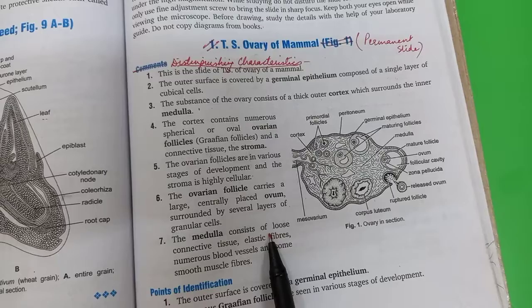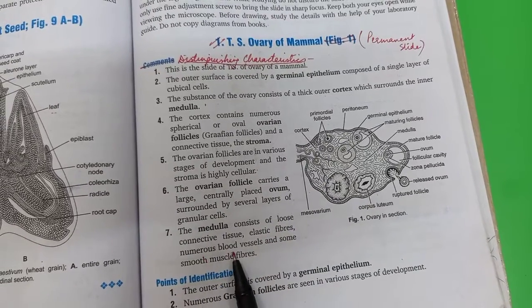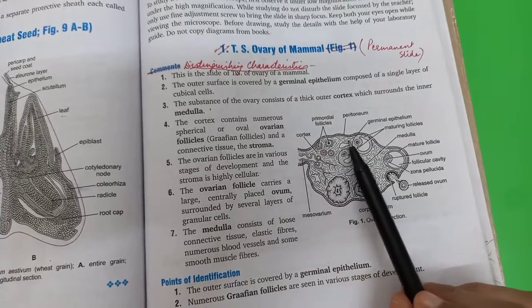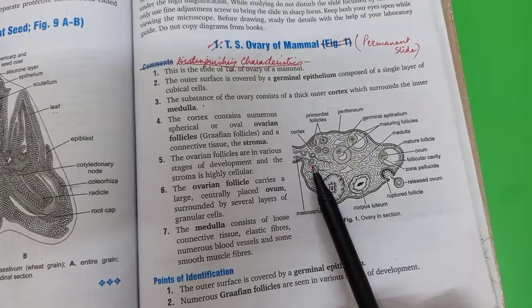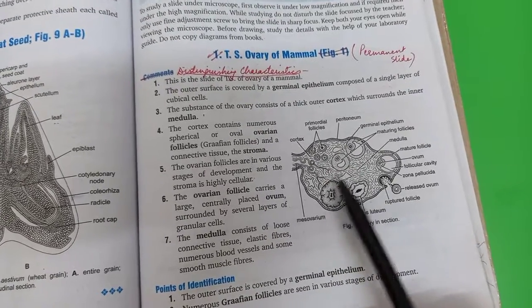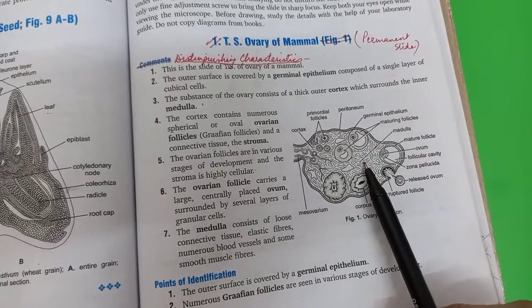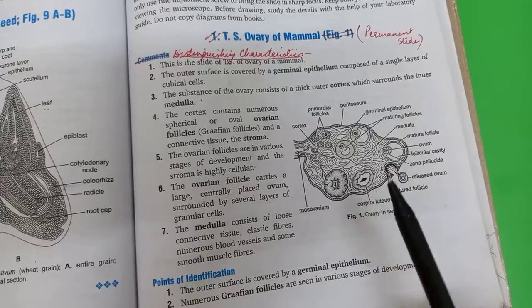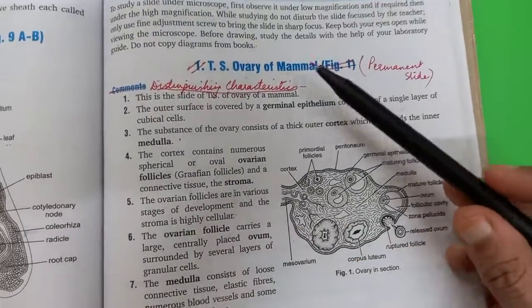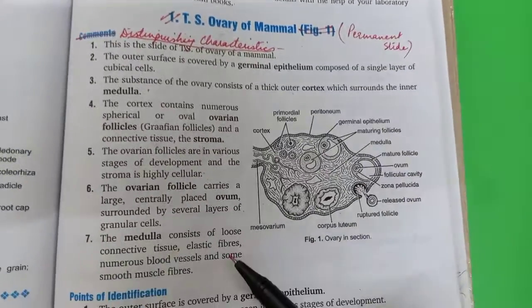The medulla consists of loose connective tissue, elastic fibers, numerous blood vessels, and some smooth muscle fibers. If the cortex is the outer region of this ovary, then the medulla is in the center. You have to describe, children, under the heading distinguishing characteristics, some 7 points.